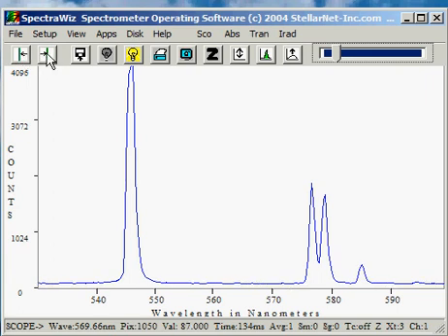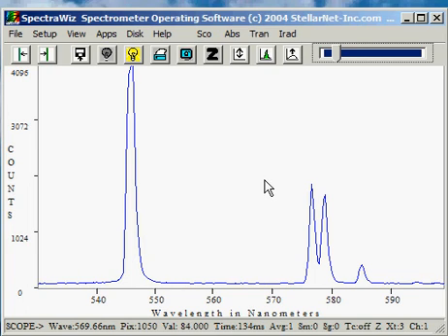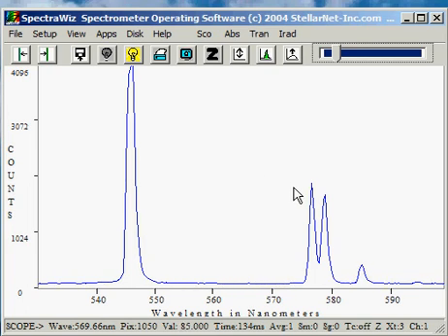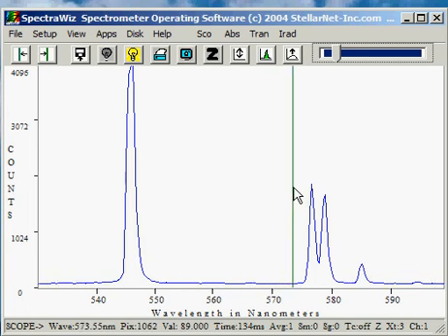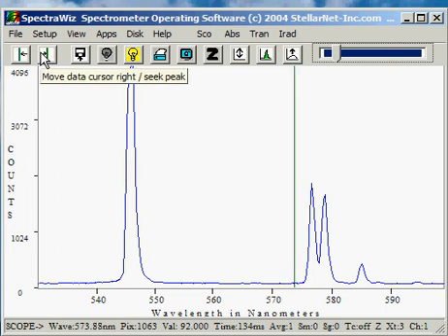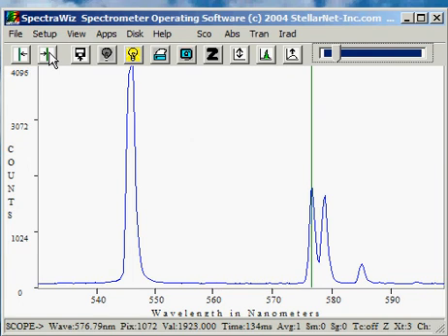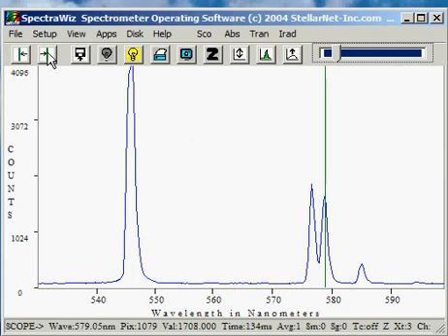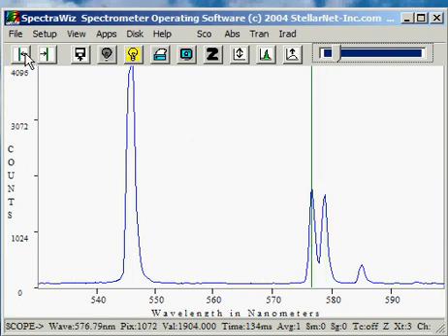These are the data cursor movement icons. If I drop a green data cursor on the graph by right-clicking, I can move the data cursor. If I right-click on the icon, it'll seek to the peak in the direction that I select.